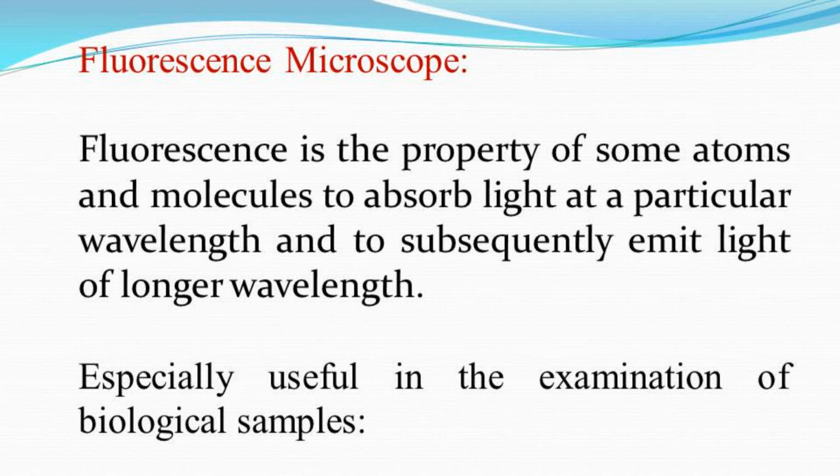Next we have the fluorescence microscope. Fluorescence is the property of some atoms and molecules to absorb light at a particular wavelength and to subsequently emit light of longer wavelength. It is especially useful in the examination of biological samples.